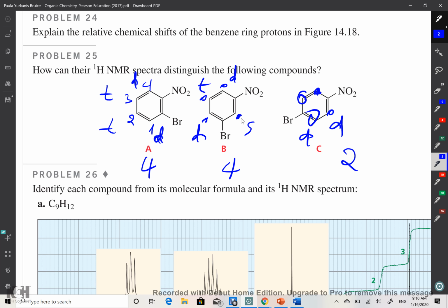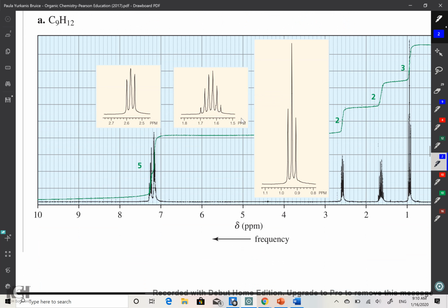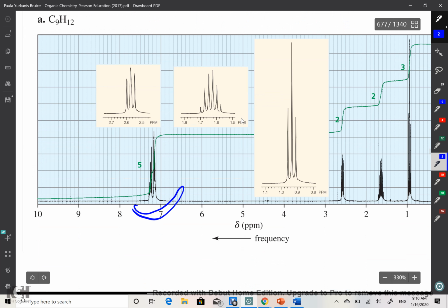But now, one thing I want to tell you is that all of them are hydrogens on the benzene ring. And according to our table, hydrogens of the benzene ring appear between 6.5 and 8. That's the region on the NMR spectrum where they appear. Because that region is very narrow, sometimes it's hard to see all those singlets, doublets, and triplets. They might just jam up together. They might all appear together, like this. You might end up having something like that.